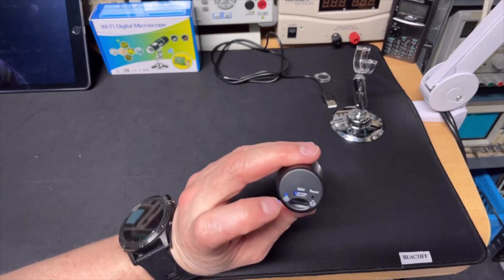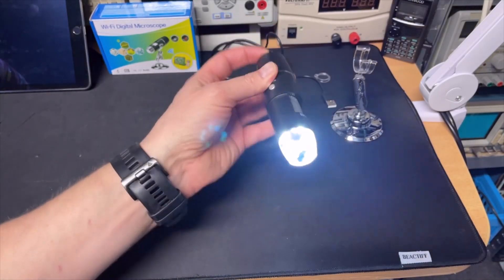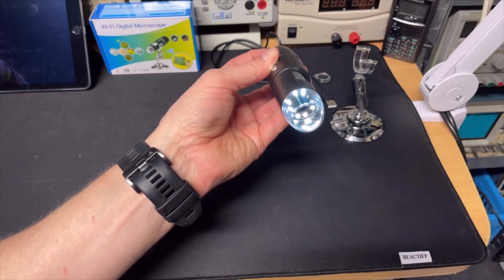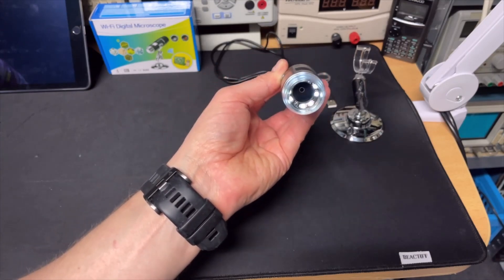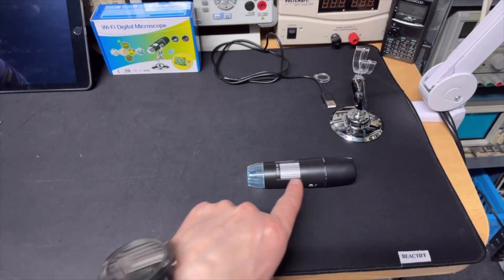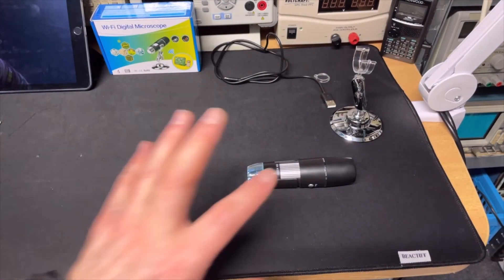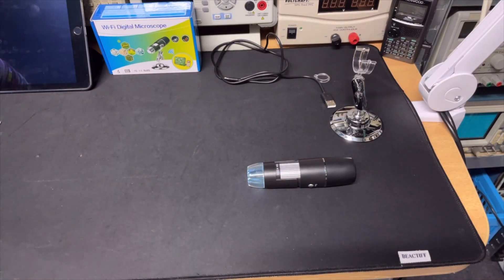It's on — I see a blue light. With the wheel, sort of a pot, you can adjust the brightness. It does have battery now, so I'll switch it on briefly just to confirm. We should now be able to connect to the Wi-Fi — this acts as a sort of access point, so we need to connect the iPad to the microscope.